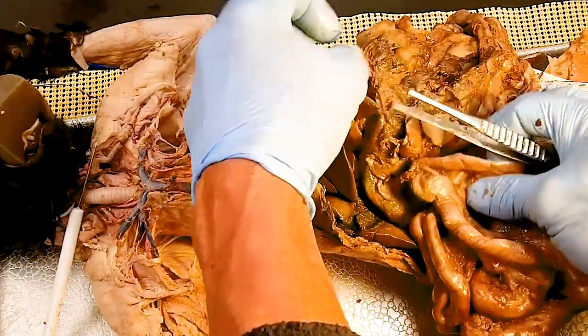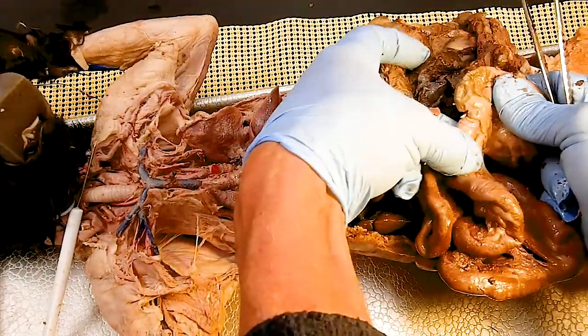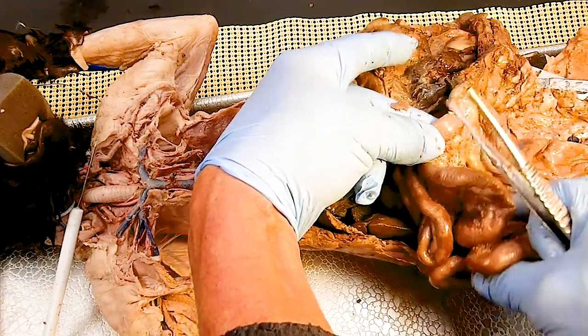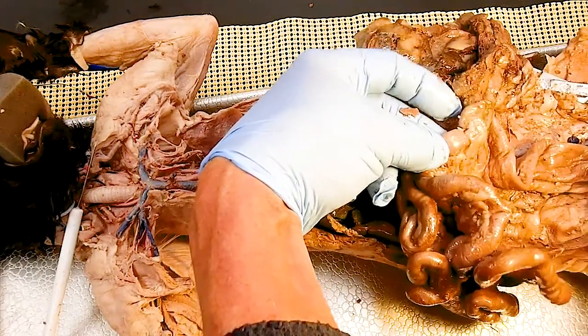If I'm at the downstream end, here's the colon. I know this is the end of the small intestine right here. That has to be the ileum. Other than that, we're not going to look at landmarks, so the rest of it's small intestine.